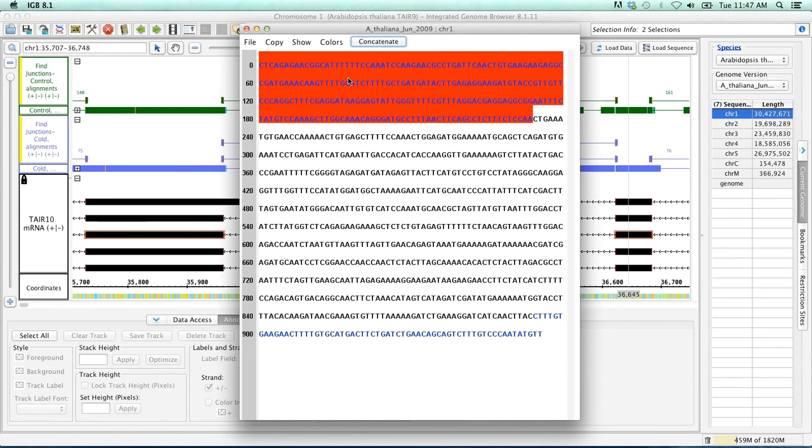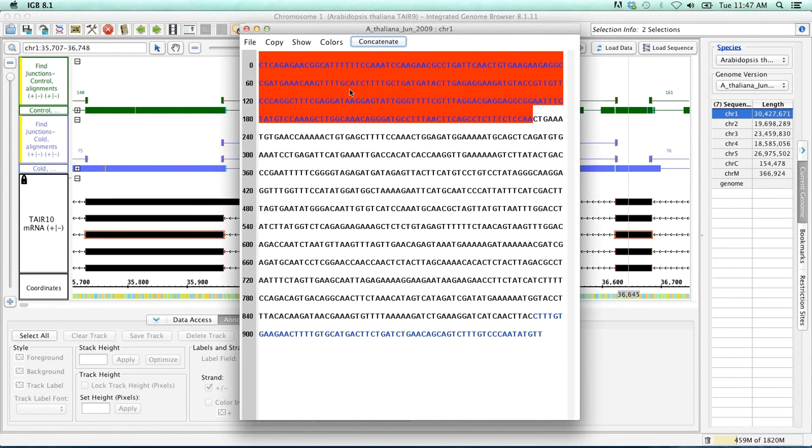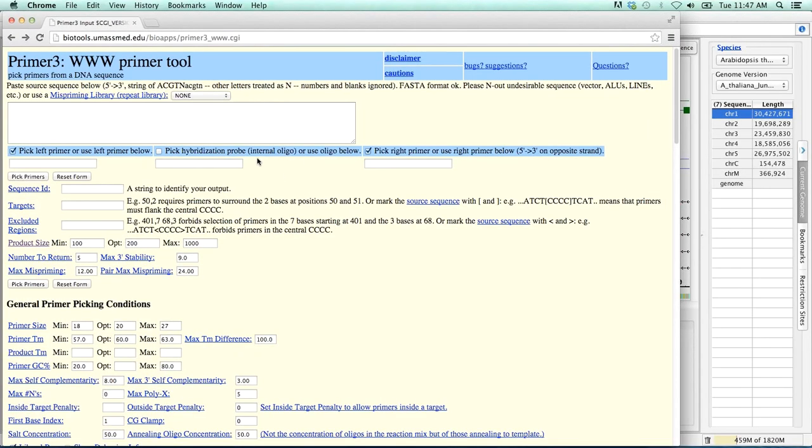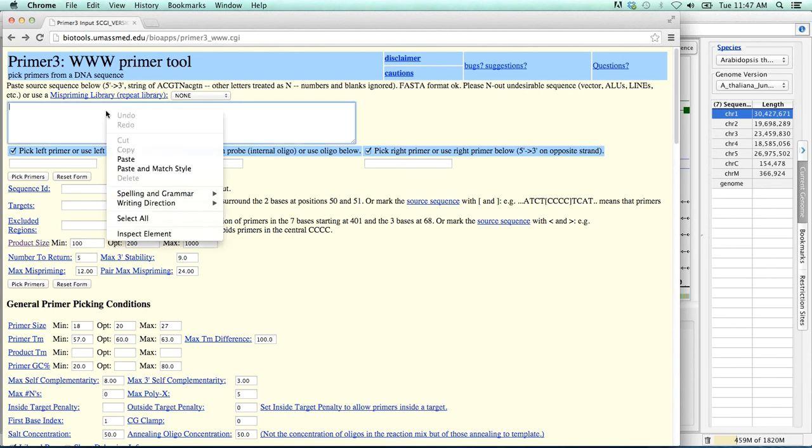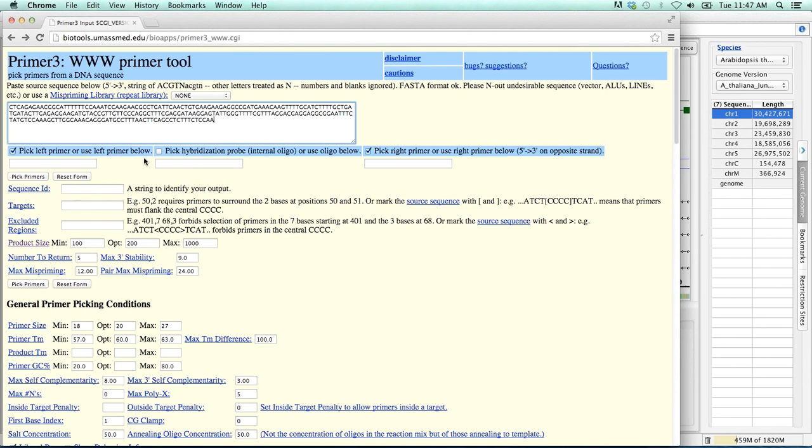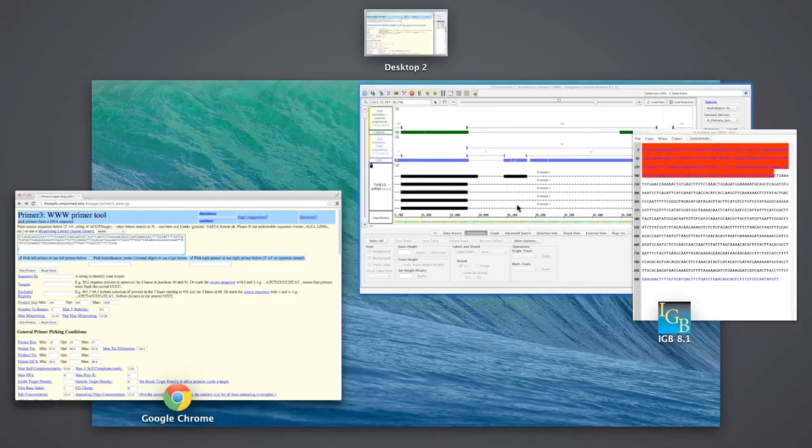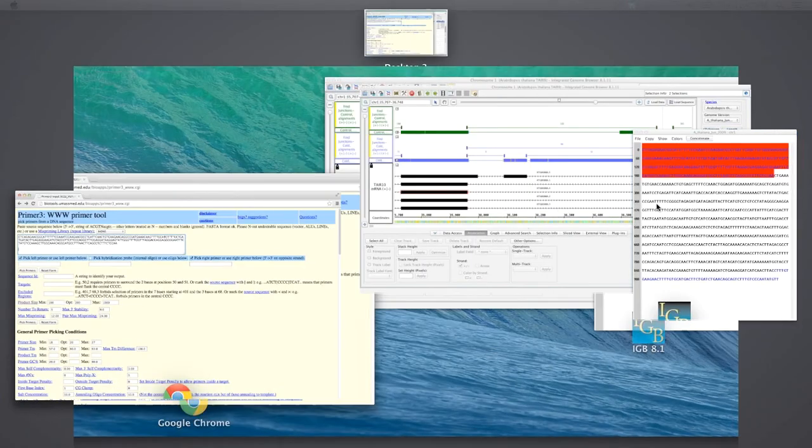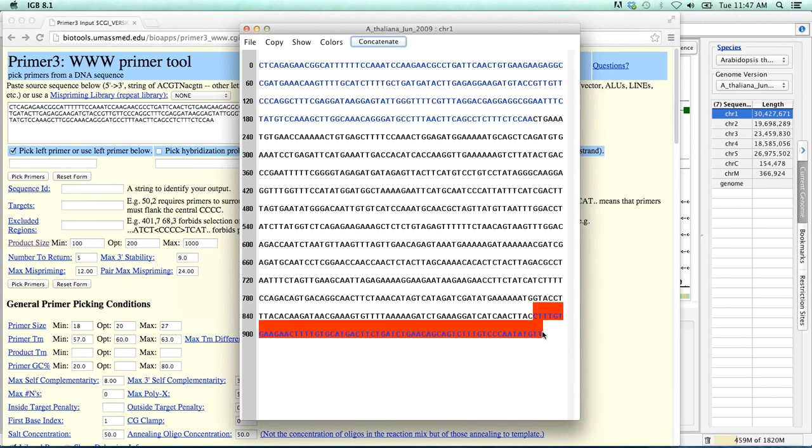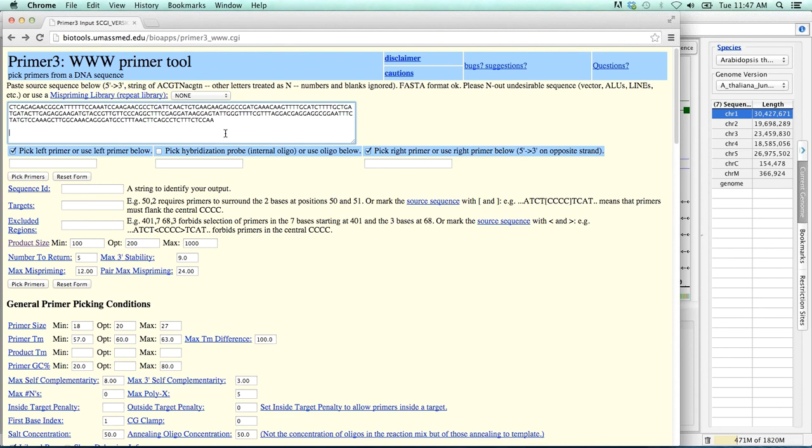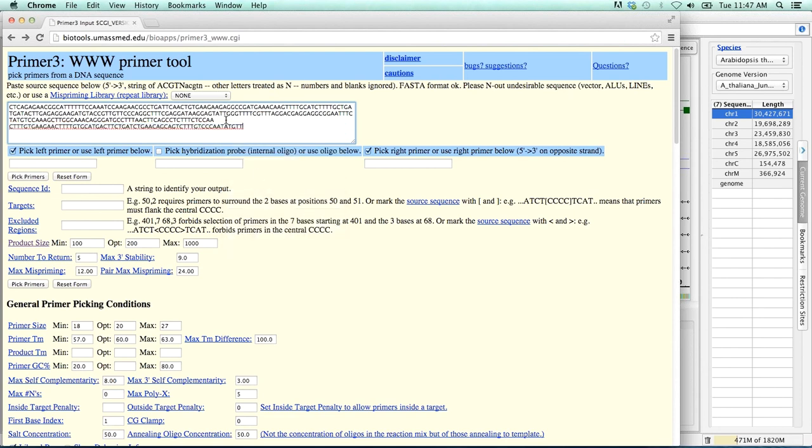Now I'm going to jump to a separate program. The program is called Primer3. It is well-regarded in terms of designing primers and this is what we ourselves use. Primer3 is freely available online. I'm going to paste that first exon in here. And then I'm going to hit enter twice. So let's jump back to IGBE. Let's highlight our second exon. And copy. And paste.